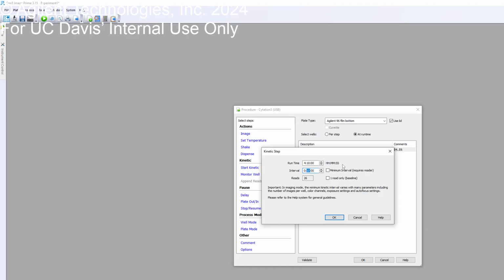I wanted to do a 30-minute recording, and then 2 minutes for every, 30 seconds, sorry? Sorry, 2 minutes? 30 minutes total and 2 minutes, yeah. So you would just do that here. You click on 30, and then in the interval time you set it up to 2. Sorry, you said 30 seconds? 2 minutes.